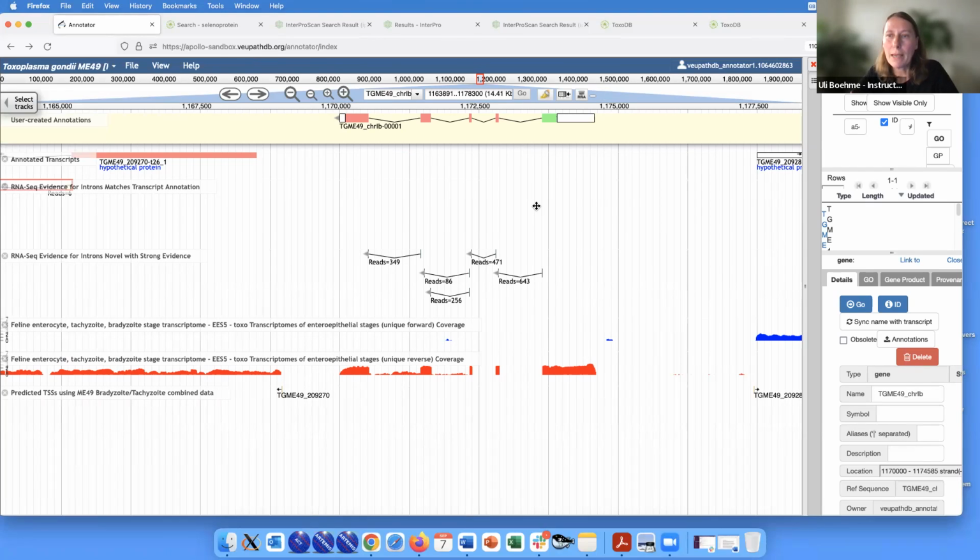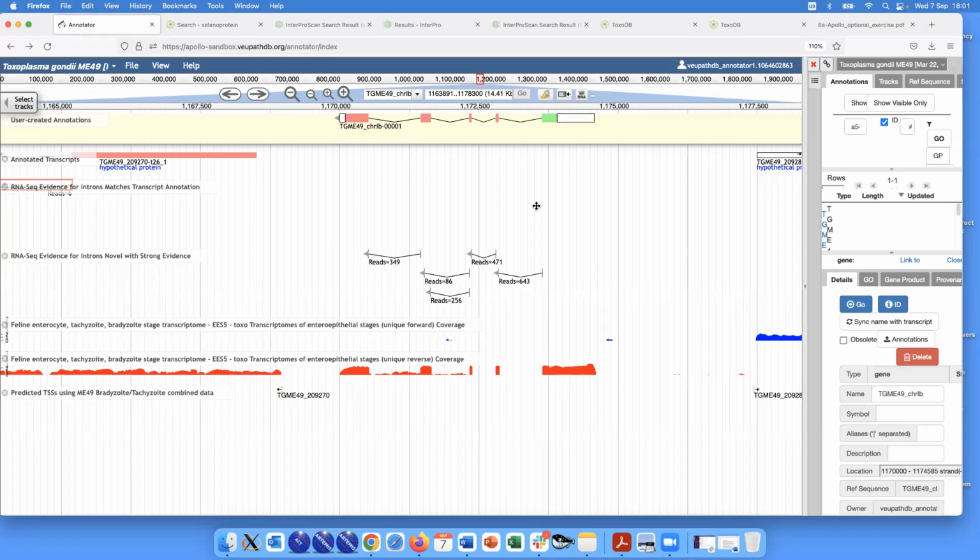So I assume this is a gap. Oma, please correct me if I'm wrong with the question mark. Typically, there are N's and not question marks. So that would be interesting. Which genome were you looking at in Apollo, or are you looking in the genome browser? In Apollo.